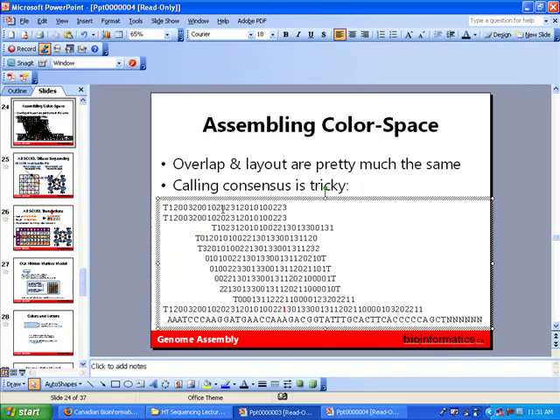Great question. What are these reads which end with the letter? So these are reverse complemented reads. Color space works tricky. There is no reverse complement. It's actually reverse, but you have to push the letter through. So what I have actually done is I've just reversed the whole read. It's actually great for those of you who are Unix hacks. And if you're not, you will become one by the end of my lab. There's a great command in Unix called rev, which will take a string and reverse it. So it's great for color space.